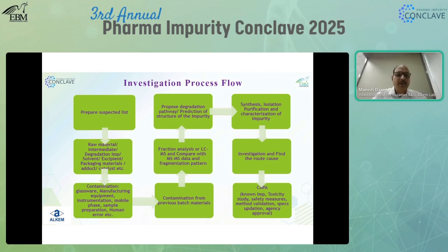And contamination is also very important. As I said, glassware during analysis, or any adjacent person doing analysis, if any glassware has been contaminated or something changed. So during phase 1 analysis and phase 2 analysis, this whole investigation is supported, and these are the probable sources of contamination for this unknown impurity. So we have to do the proper root cause investigation during hypothesis and investigation in the quality control department to identify where this unknown impurity is coming from.